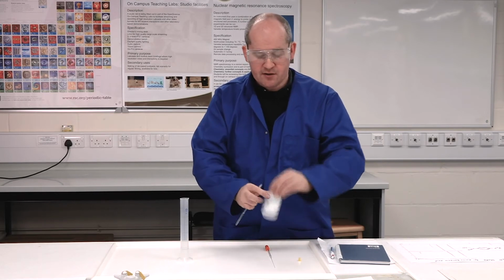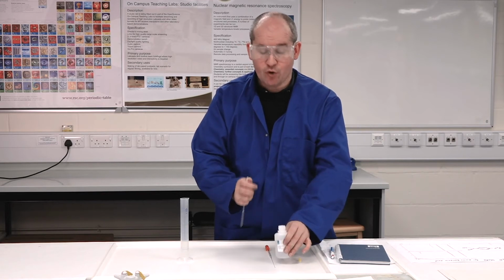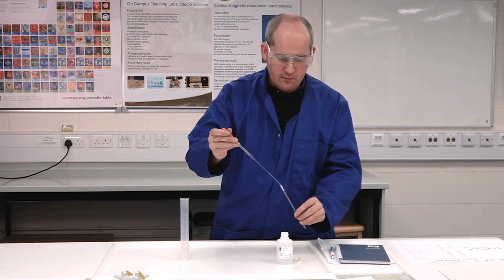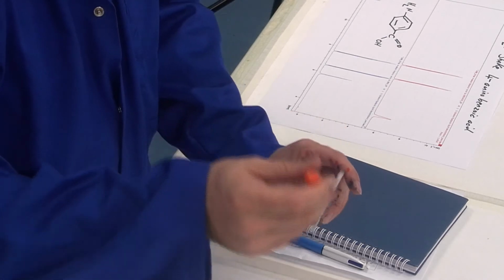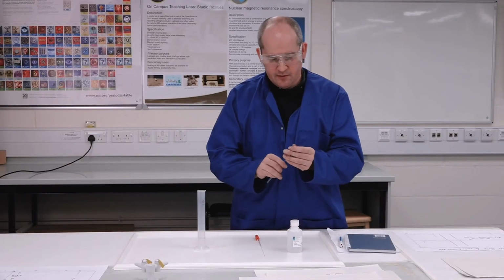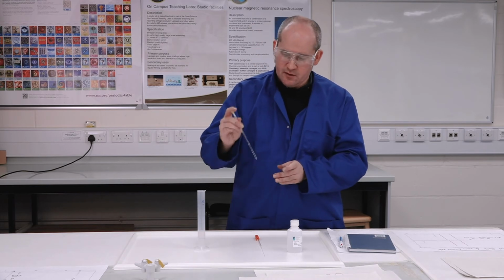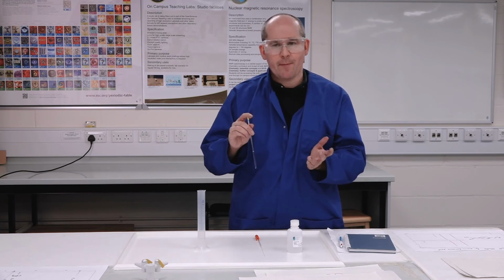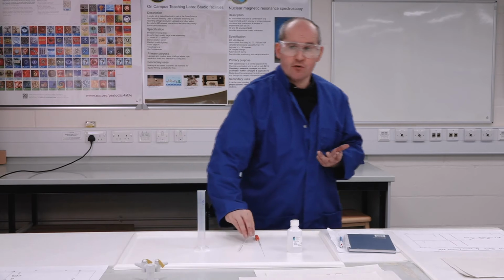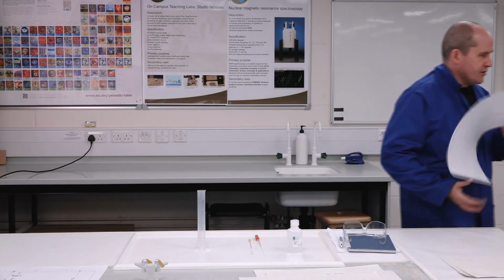So let me just take off the lid and open up my D2O. And all I have to do literally is add a few drops. It's a really easy experiment. Take a pipette and add a bit in, like that. Then put the cap back on, and give it a little shake. And then all we would do is run the spectrum resulting from that. So that's literally how you do a D2O shake. Let's go back and have a look at the effect. We've rerun the sample, so I'll leave my coat on and bring the spectra across.